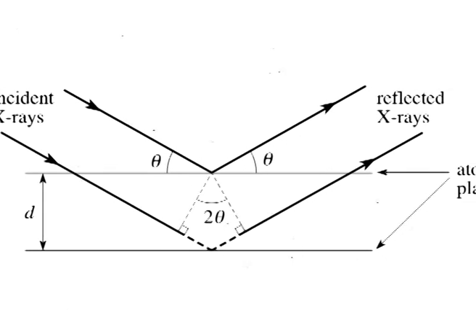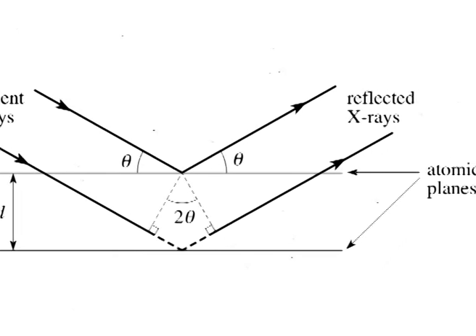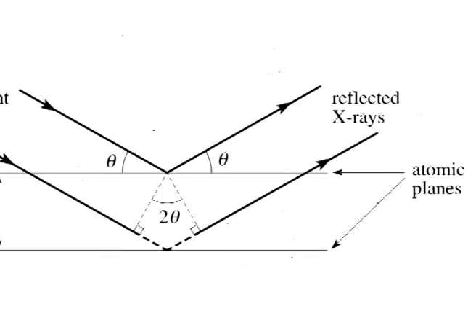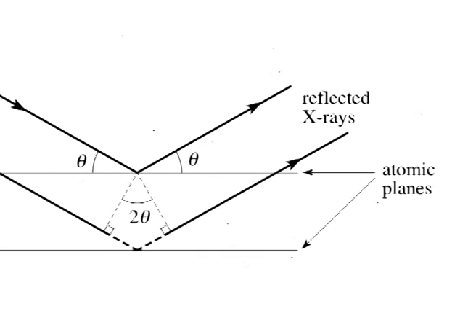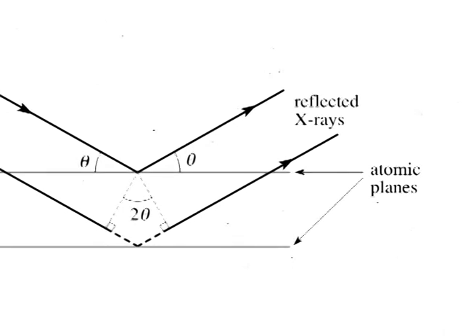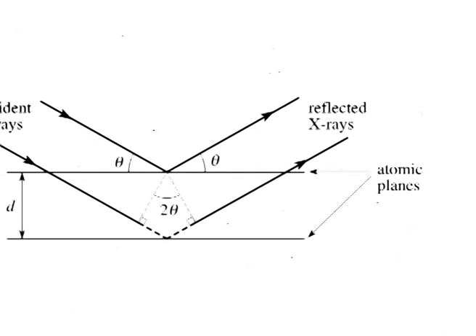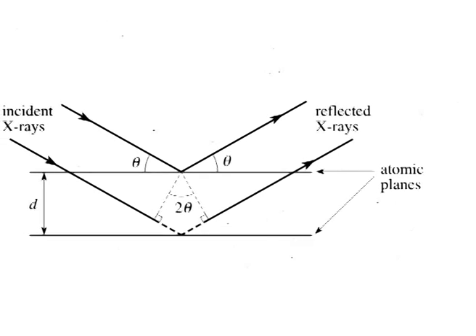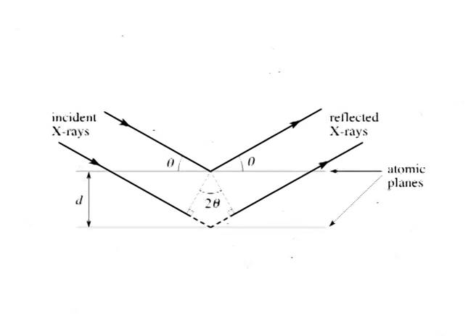Ray 1 reflects off of the upper atomic plane at an angle theta equal to its angle of incidence. Similarly, ray 2 reflects off the lower atomic plane at the same angle. While ray 2 is in the crystal, however, it travels a distance of 2a further than ray 1. If the distance 2a is equal to an integral number of wavelengths, lambda, then rays 1 and 2 will be in phase on their exit from the crystal and constructive interference will occur.